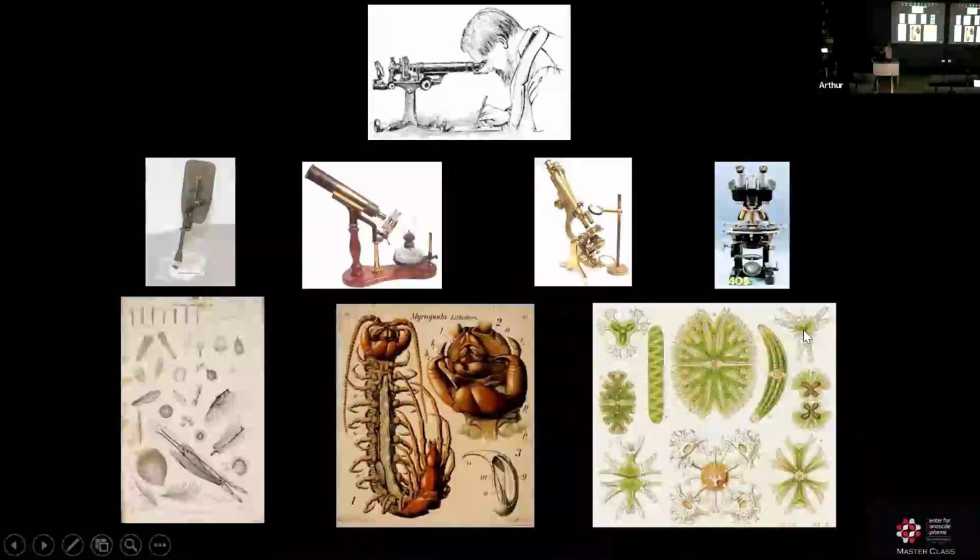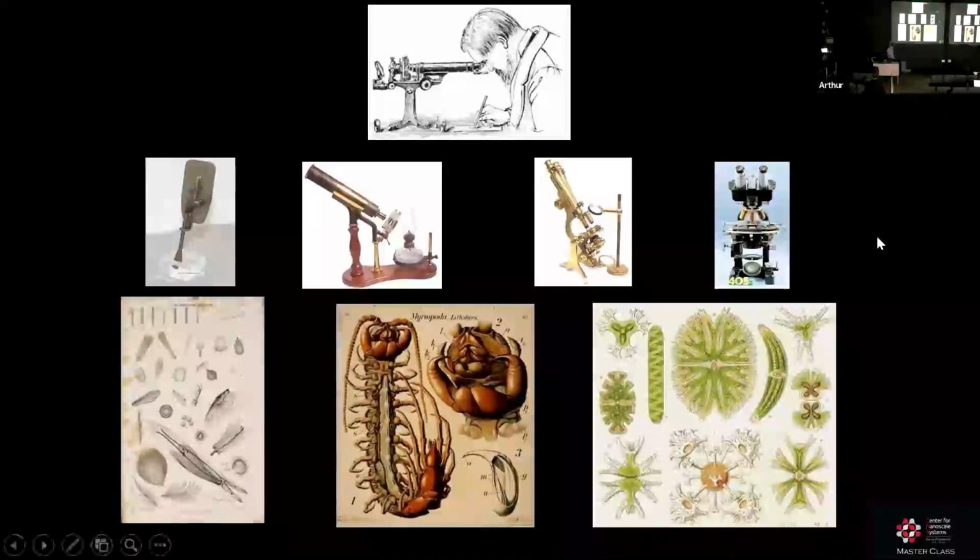Okay. So I like to start with this slide when we're talking about biological imaging. It shows us the history from where we're coming from: the very first micrographs hand-drawn by some of the greatest scientists and biologists in the beginning of time. And it shows how biology has always been an imaging science, documenting phenomena by drawing and by taking pictures, from the first Leeuwenhoek microscope, which is basically a glass bead, to now today our super duper Titan cryo-electron microscopes. We've gone a long way in about 100 years.